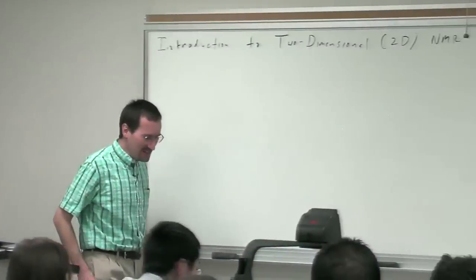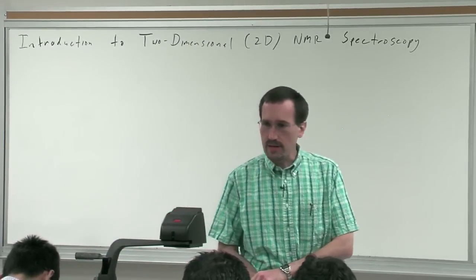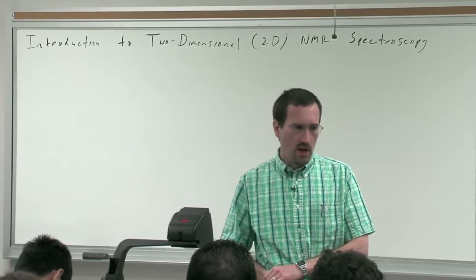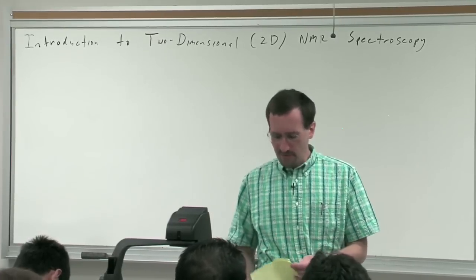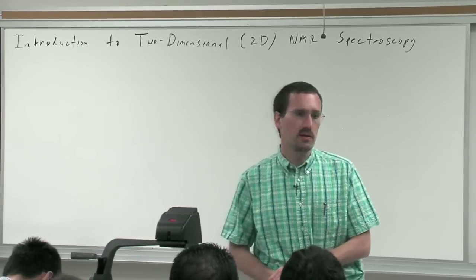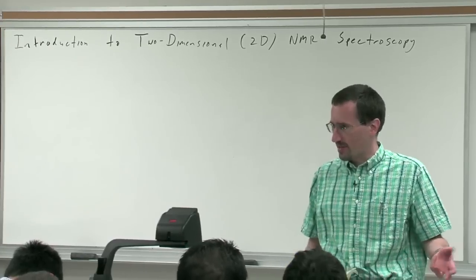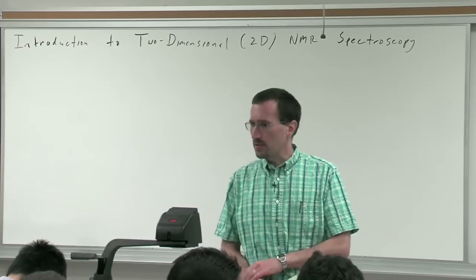I want to move on and start talking about 2D NMR spectroscopy. What we're going to do is use this as a tool, very, very useful for structure solving. There's a whole alphabet soup of different techniques, but rather than just unleashing a torrent, people do research in this area just like they do research in organic chemistry, and the big thing is to invent a new technique to solve specialized problems.